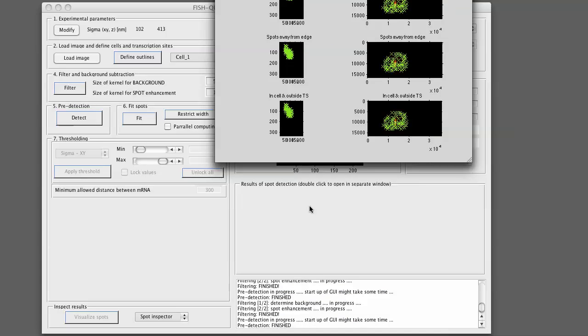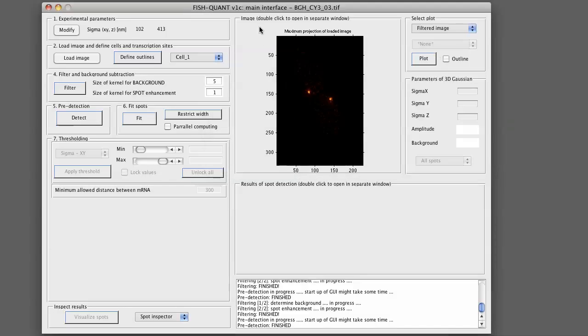If you click on this, the pre-detection is finished as indicated below. And now we see that the Fit Spots is enabled. This will be shown in the second part of this video.